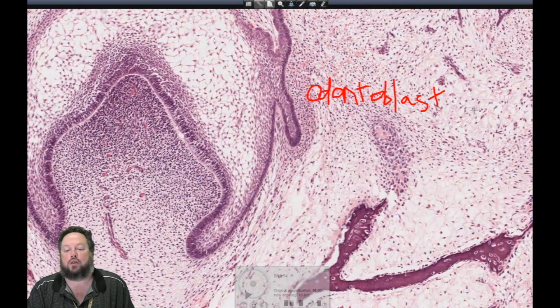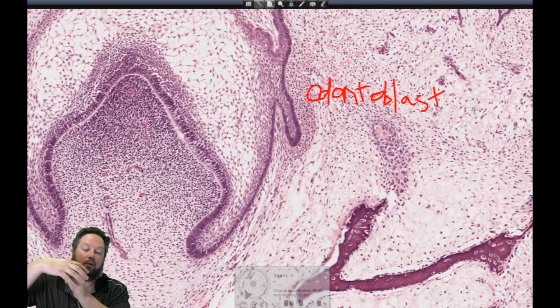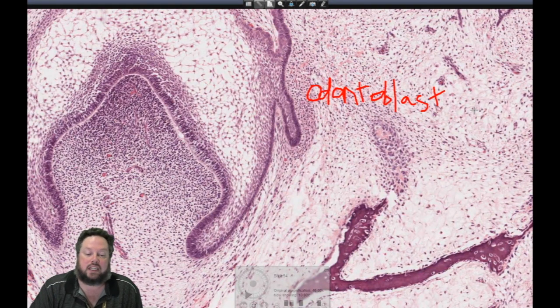It's probably a little bit beyond what we actually need to know, but I don't know the specifics about the formation of the pulp chamber. I think of them a little bit like a hair follicle. We've got the hair bulb, and the hair papilla, which contains the nerves and blood vessels of the connective tissue, and it almost looks a little bit like a hair bulb here as it's beginning development.